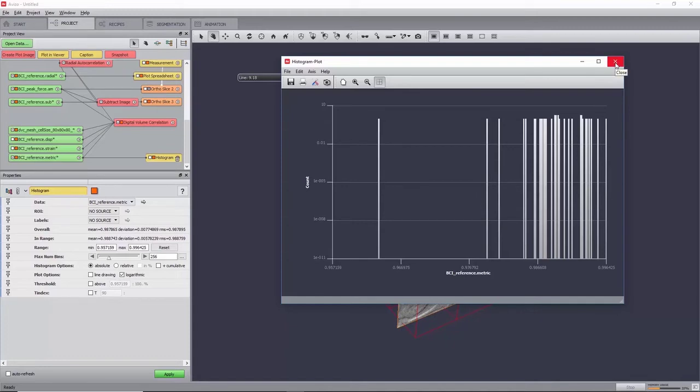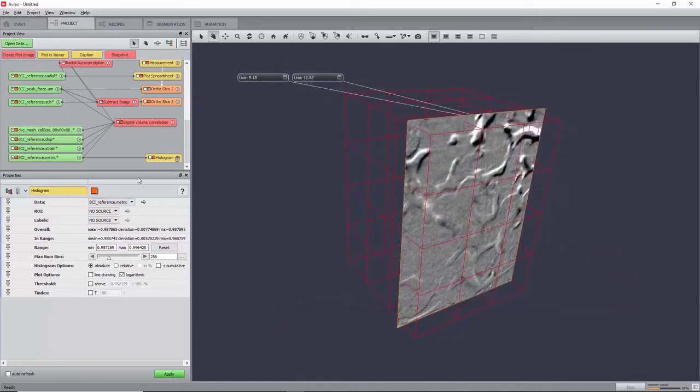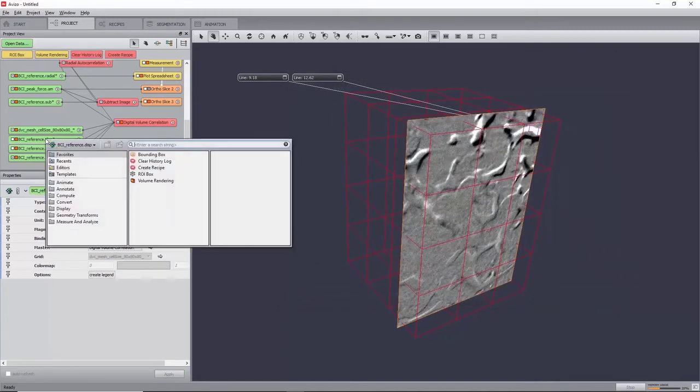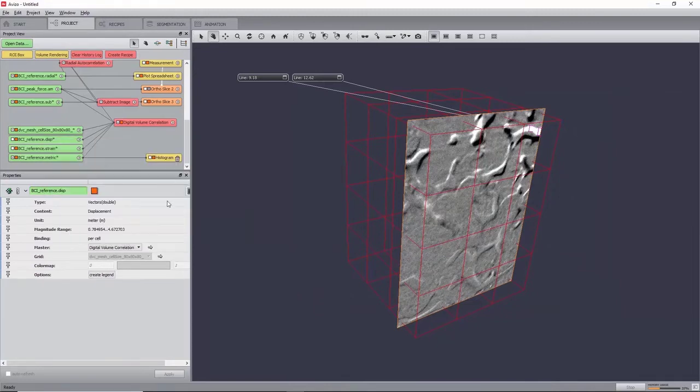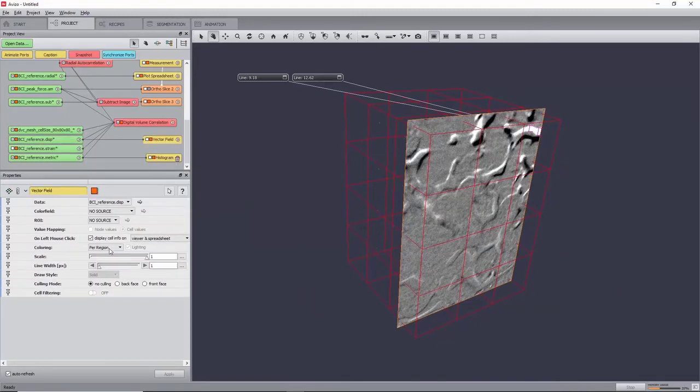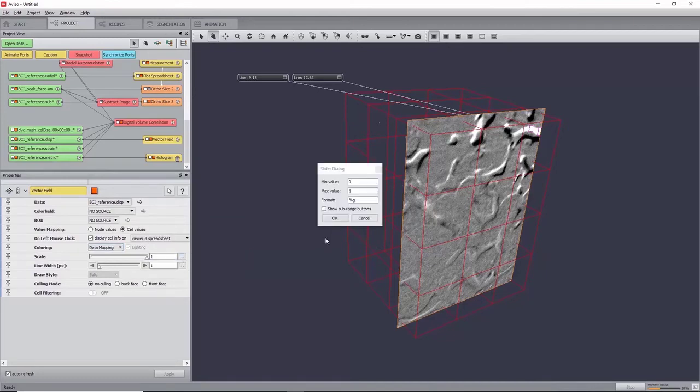The displacement field can be viewed by creating a vector field module, setting the coloring to data mapping, and increasing the scale by clicking on the three dots to first increase the maximum value to 10, and you can now slide the scale up to 10.